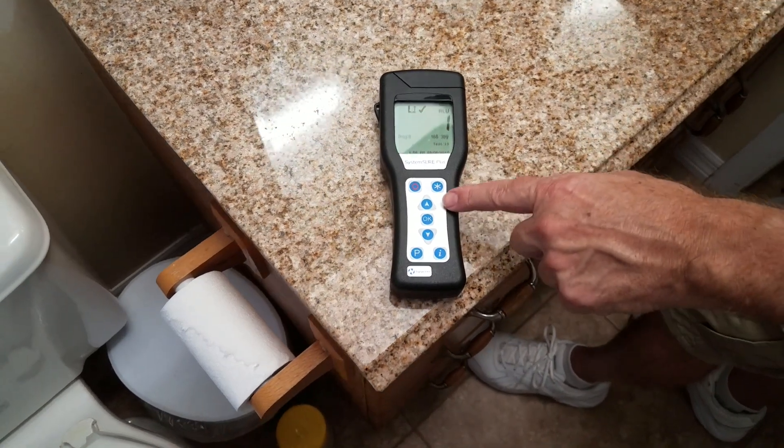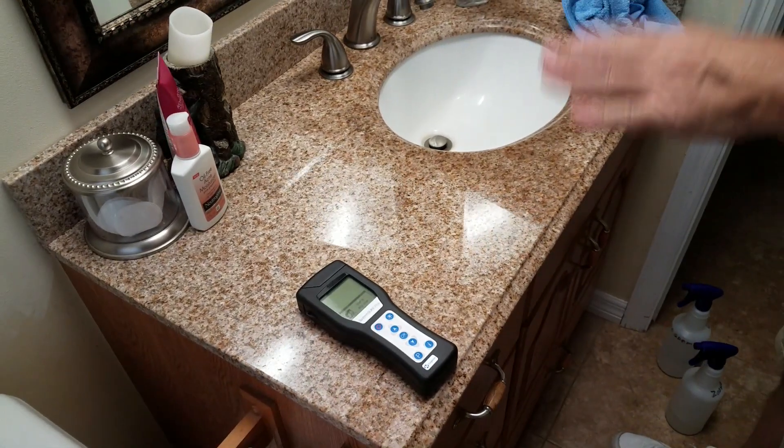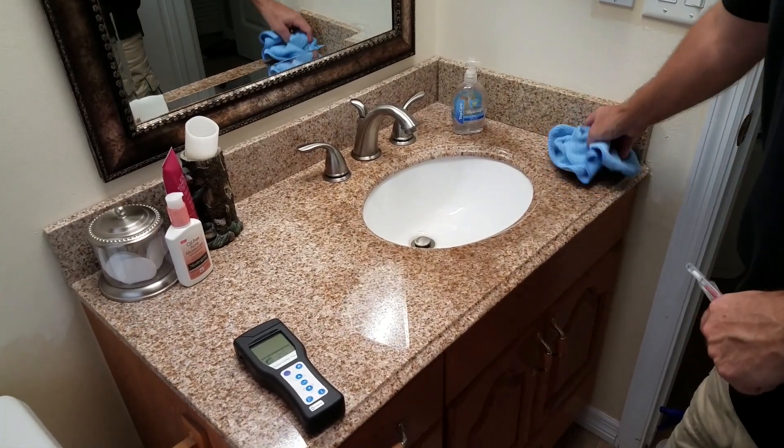Down to one. So what this shows is we can lower the germ and virus count on a surface better than regular cleaning products. And the Zuno will keep it clean for 90 days.